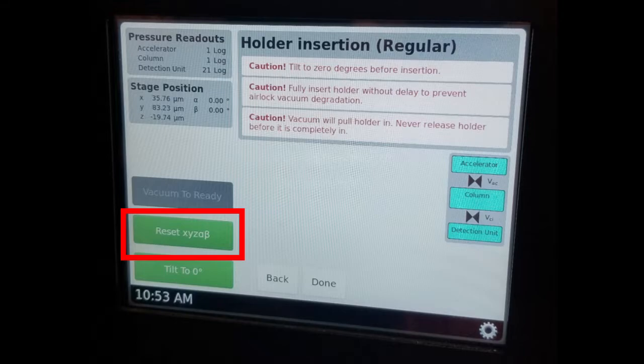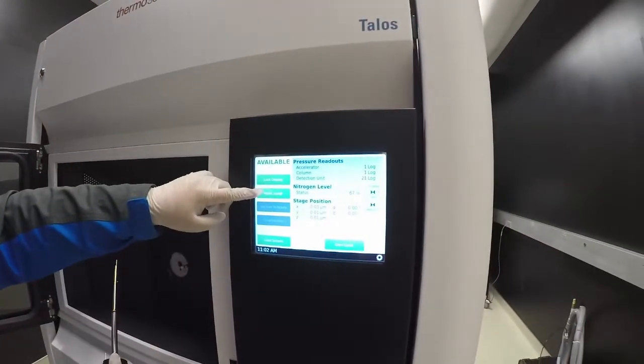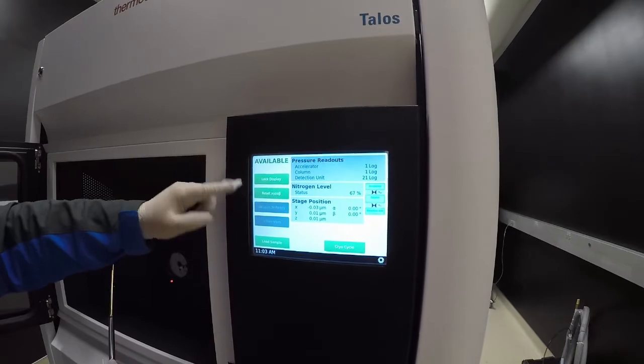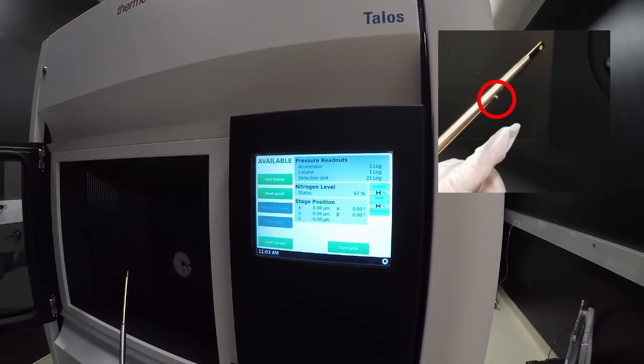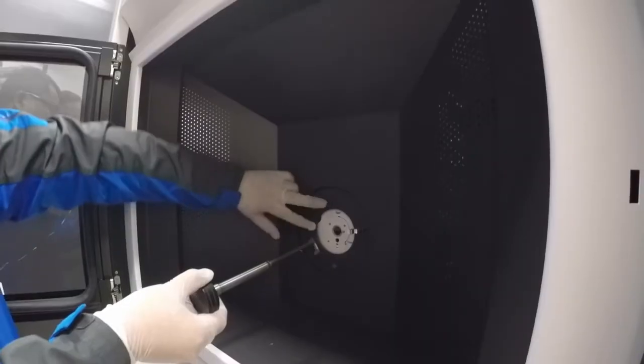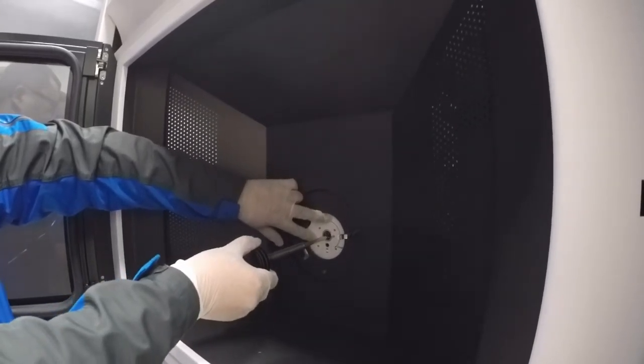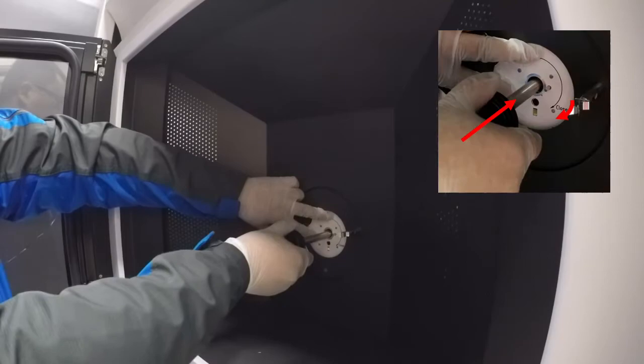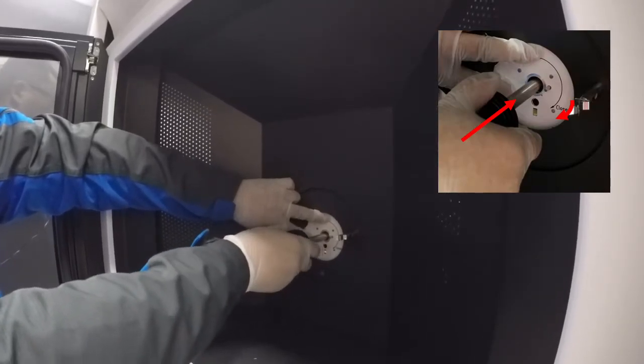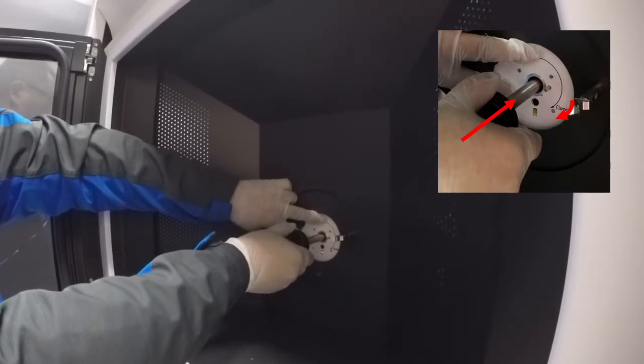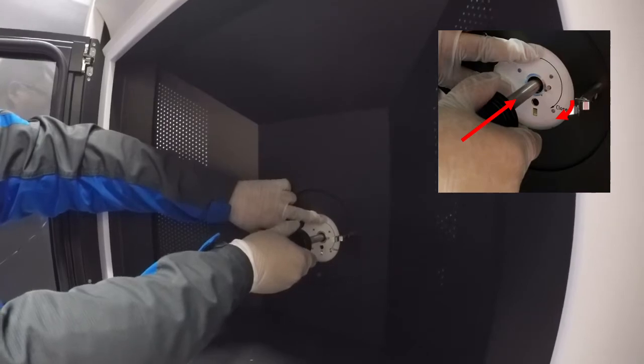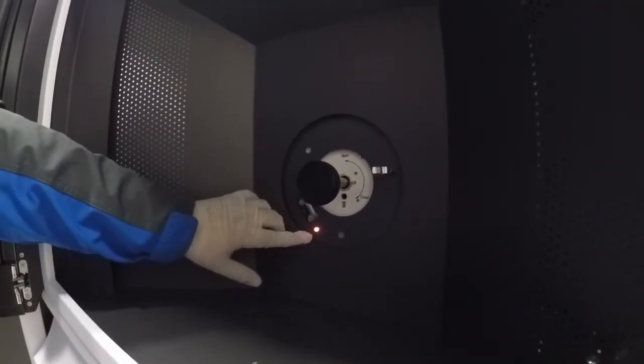You are now ready to insert the holder. There is a metal notch on the holder. Hold this notch at the 3 o'clock position and insert the holder most of the way. Finalize the position by turning clockwise to the 5 o'clock position. Once in this configuration, a light will indicate that the system is pumping.